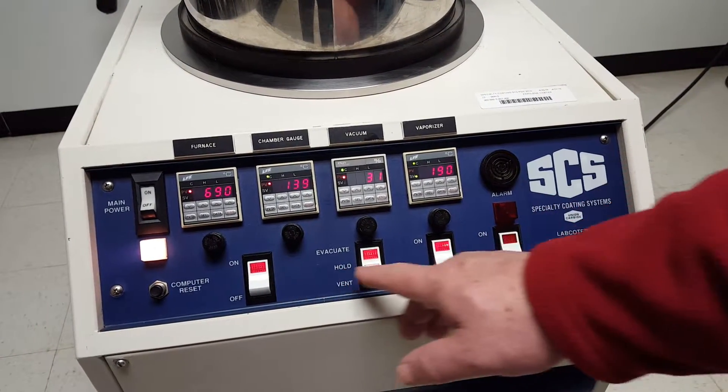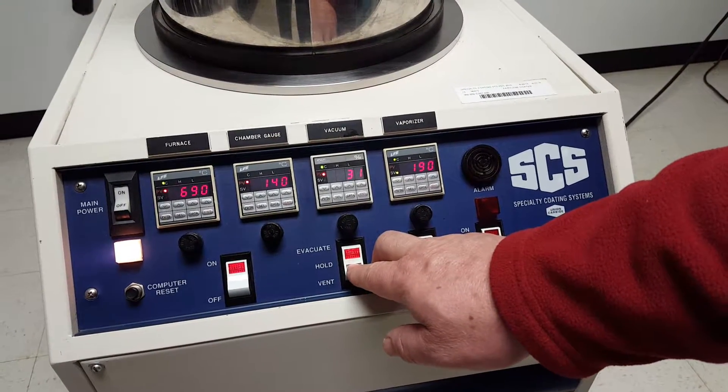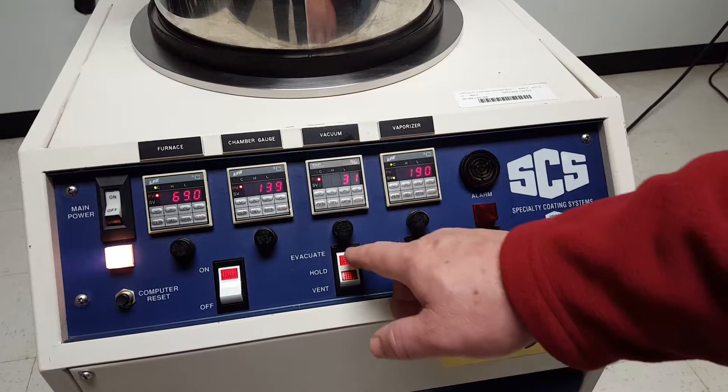Basically, you have your on/off switches for everything. I'm going to go ahead and have this evacuate in the meantime, but you can see that the chamber is down to 31.